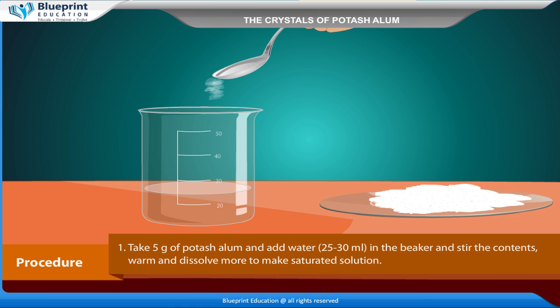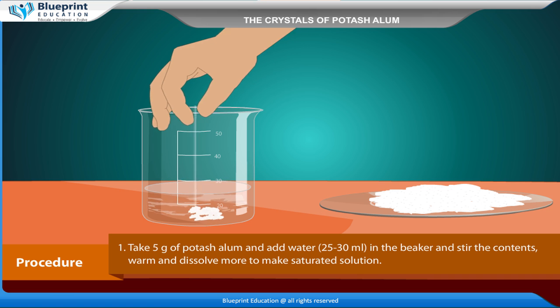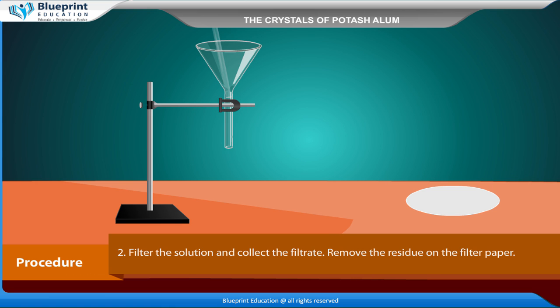Take 5g of potash alum, add 25–30 ml of water in the beaker, and stir the contents. Warm and dissolve more to make a saturated solution. Filter the solution and collect the filtrate. Remove the residue on the filter paper.